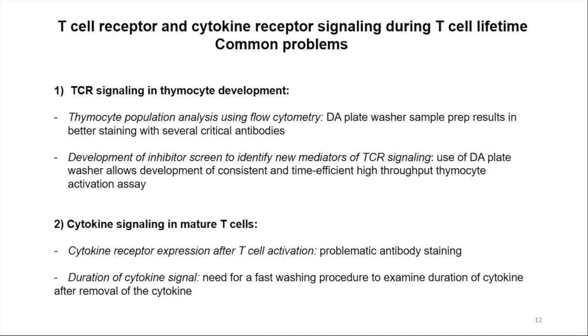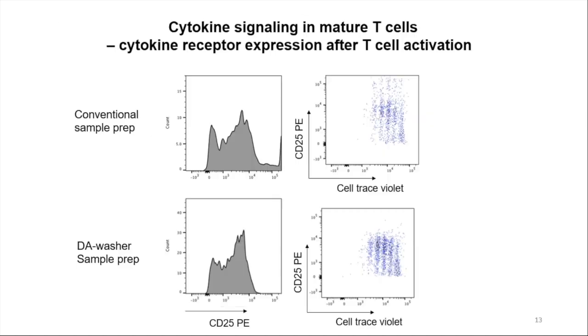And another issue we had: we tried to develop an experimental system to allow us to examine the duration of the cytokine signal after the cytokine itself has been removed. And for this, we need a very fast and relatively gentle washing procedure. So we'll start with some very bad data.